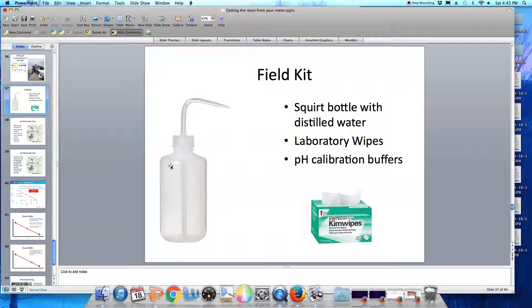When you are going out in the field to do pH measurements, make sure that you bring a few extra items with you, such as a squirt bottle with some distilled water in it. You're going to need this for cleaning your electrode. You're going to need some lint-free laboratory wipes, such as kimwipes, and you are certainly going to need your pH calibration buffers.